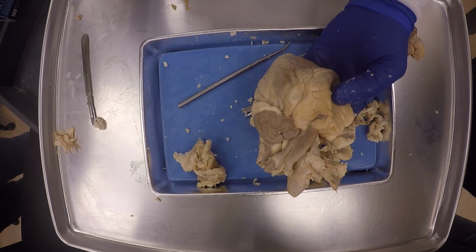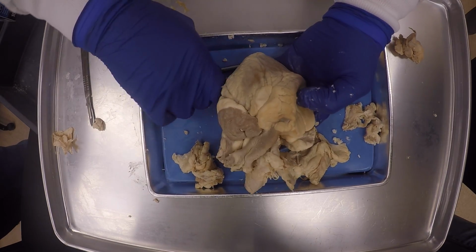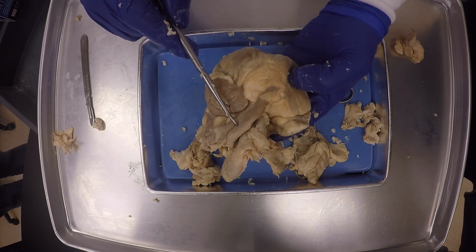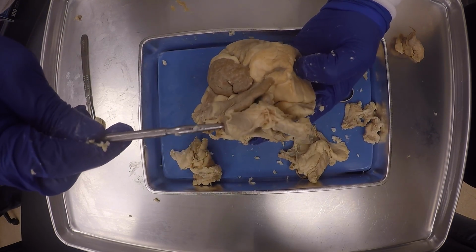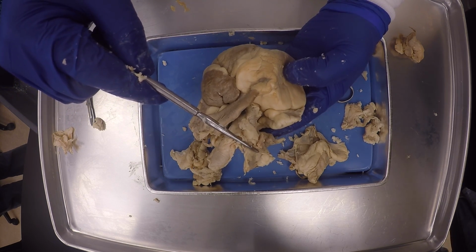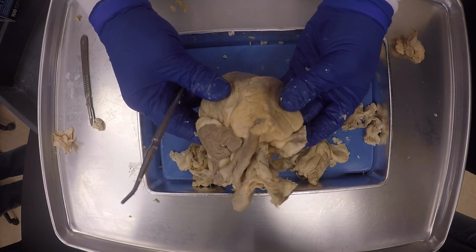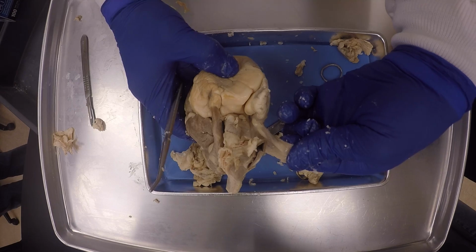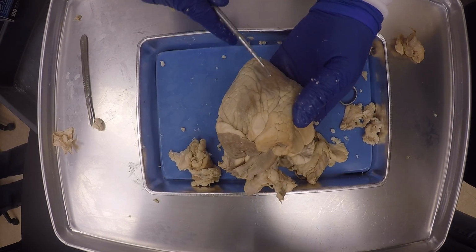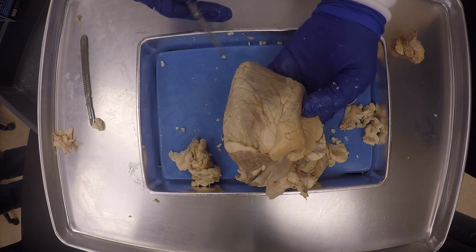So the second order of business, once we identify the anterior side, is to identify the 4 great blood vessels. We've already done it, starting with the pulmonary trunk. This is the aorta, and this is the brachiocephalic trunk, which is the first branch of the aortic arch. Because we know this is the right side, this is probably going to be the superior vena cava. The right side is smaller, and the left side is bigger. The left side always includes the apex, even when I cut and open it.